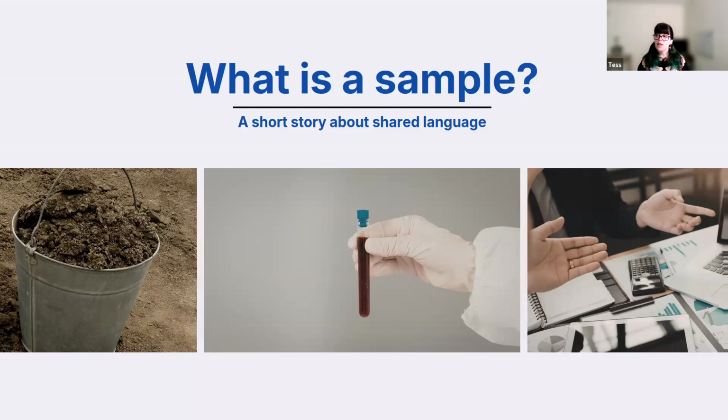One scientist said, this bulk sample that we got is the sample that we're using in recording in SciNote and the experiments that we're running. While another scientist said, no, it's the bit that we're pulling out from that bulk sample that we're calling a sample for an experiment. Now, you can imagine that having these two vastly different definitions of samples can have issues downstream in analysis.